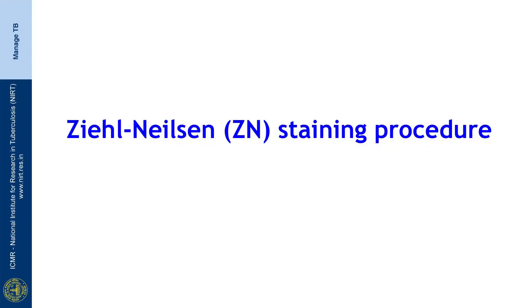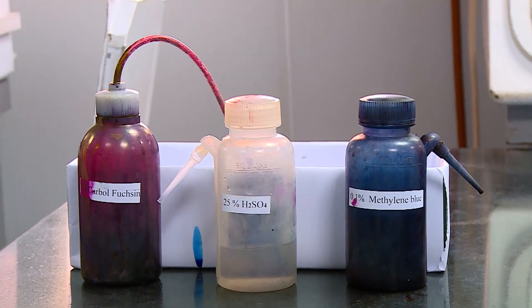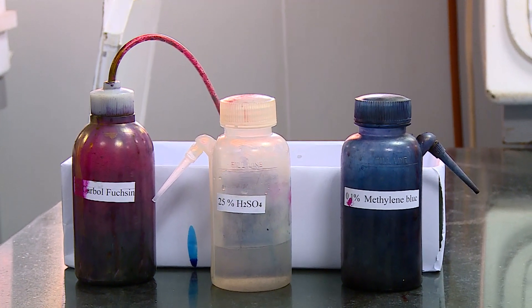We will now see the Ziehl-Neelsen staining method. First, the fixed smear is flooded with filtered carbol fuchsin, which is the primary stain. The slide is heated gently from below until steam arises, and left for about 7 to 10 minutes. The stain is then washed off with water gently. The smear is then flooded with 25% sulfuric acid for about 45 to 60 seconds, washed with water, then flooded with methylene blue and left for 45 seconds. After washing, it is allowed to dry. A drop of liquid paraffin is placed on the smear and it is seen under the oil immersion objective. The 3 staining solutions are 1% carbol fuchsin, 25% sulfuric acid, and 0.1% methylene blue.